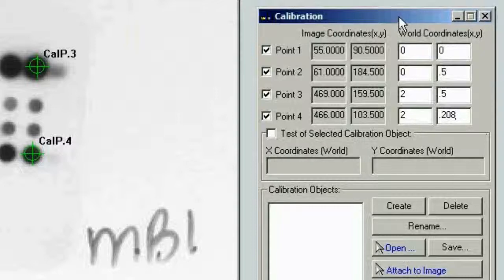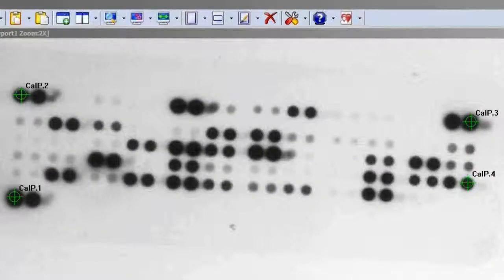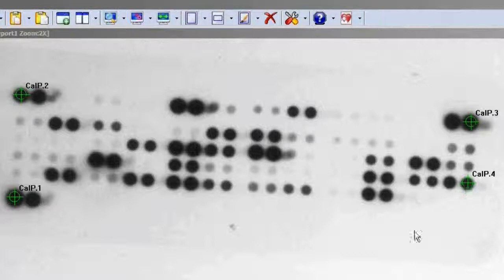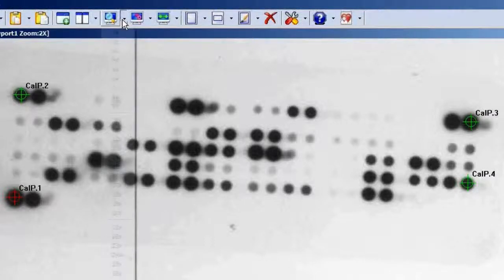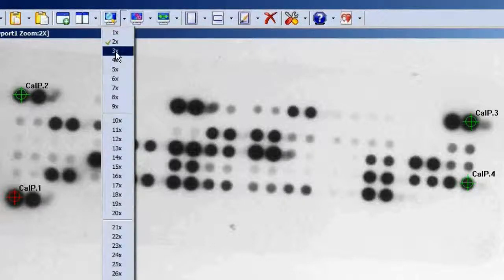If your template differs or you have a different template, the method is the same — you'll just have different values. You should always pick the lower left, upper left, upper right, and lower right points as best you can to get the best calibration possible. Another good idea is to make sure that these points are as centered as you can get them visually.